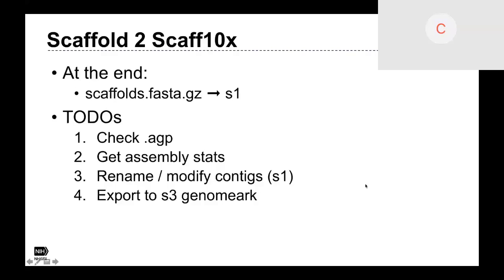Yeah, thanks, Chai. That was very important. Okay. So just to make sure that I understood, here you had 10 files of the sequencing run and 1 index file, right? But you want to select only the forward reads. The forward, yes. The reason I suggest you try to clear the filter and take a look at the folder yourself is because sometimes data come from different providers, and some providers didn't have the naming convention that 10x uses as a standard.